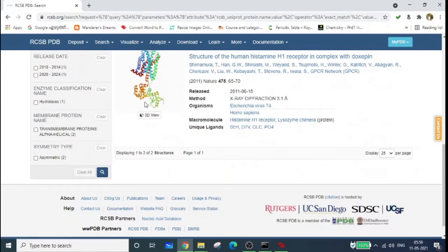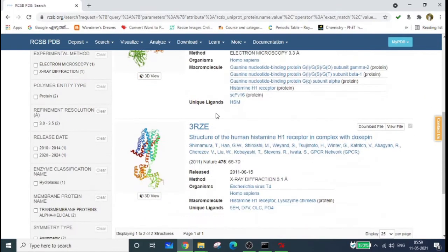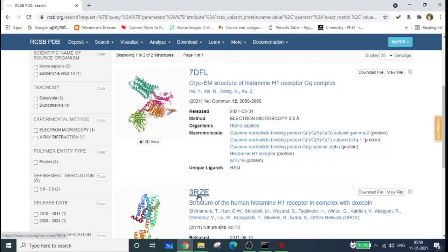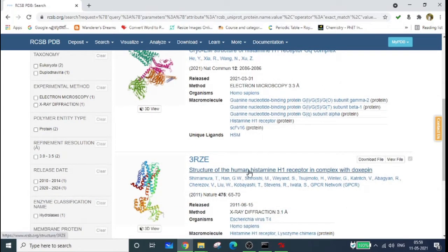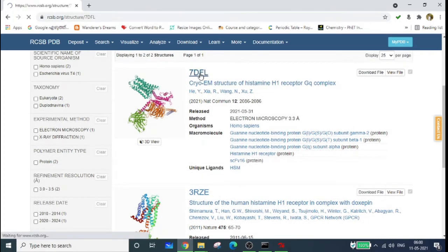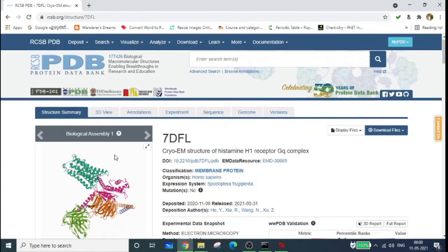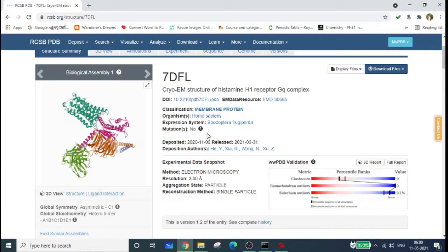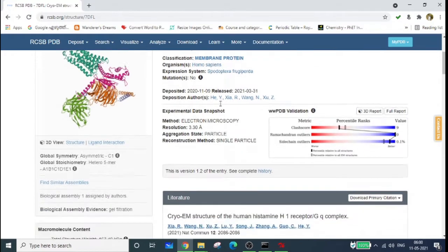Here we get many structures. In this case there are two: one named 7DFL and another 3RZE. You can download either of these. The first structure is the Cryo-EM structure of histamine H1 receptor and Gq complex, and the second is the structure of histamine H1 receptor in complex with doxepin. I'm downloading 7DFL — just click on it. Note that this molecule is actually a complex, not a simple pure receptor.